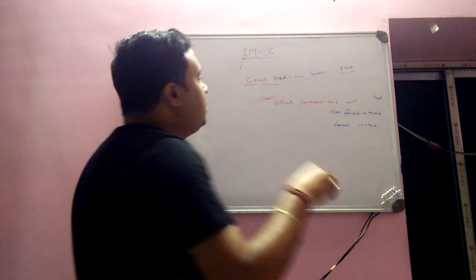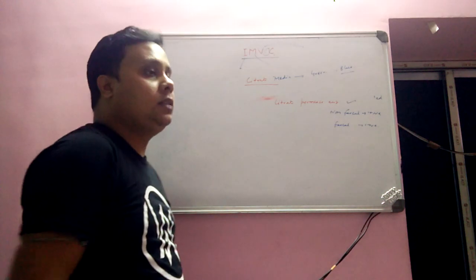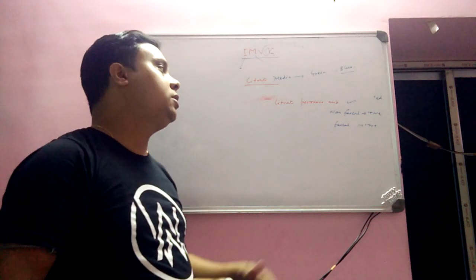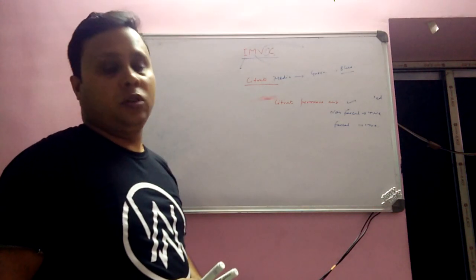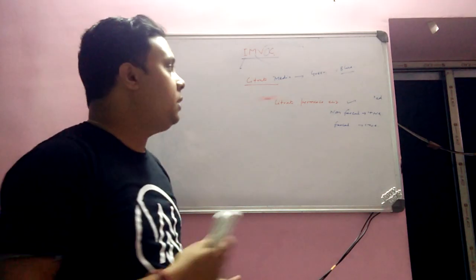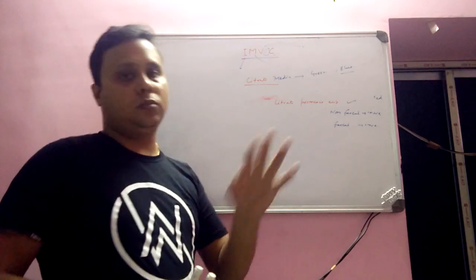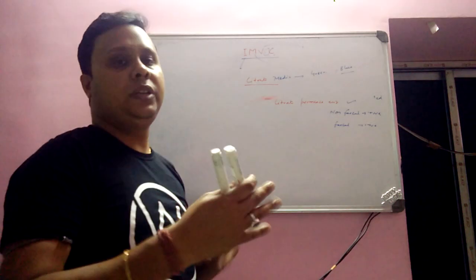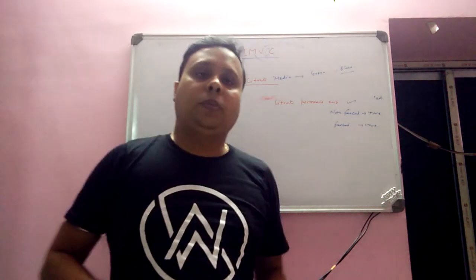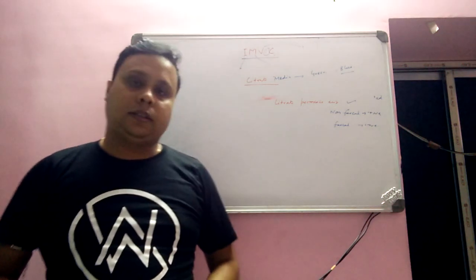So the dye can be present in the media, in Koser citrate broth or Simmons citrate agar media, whatever it is. If the organism is capable of growing in that media, we can detect that the organism is non-fecal. If the organism is not able to grow, we can say that the organism is fecal. Simultaneously, we can also check whether the media has turned from green to blue or not. If it is turning green to blue, then we can say that some pH change must have happened in the media. Right. So this is the basic of the IMViC test. Hope you have understood what the IMViC test is, why we should perform the IMViC test, etc. Right. Thank you.